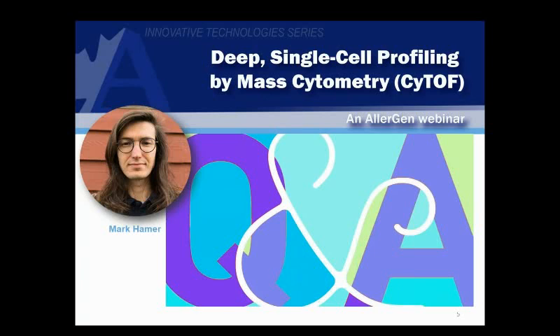Fantastic. And then the last question for me is, I've seen a lot of debate on whether it's most efficient to use CyTOF as a discovery tool or as an analytical tool. So for example, if you had 100 patients that you wanted to characterize, would it be better to use CyTOF to try to identify, with 50 antibodies in that CyTOF discovery experiment, the 10 that are going to be useful for distinguishing differences between patient and normal? Or do you think it would be more efficient to use CyTOF for analyzing a whole 100 patients and get all of that information? What do you think?